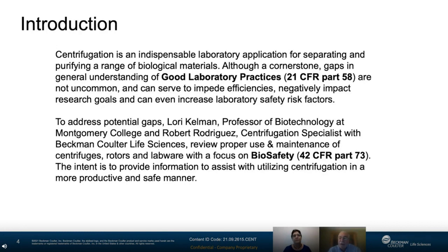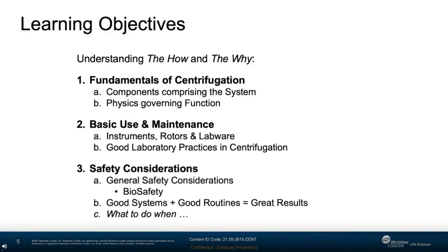The intent is to provide information to assist with utilizing centrifugation in a more productive and safe manner. These are our learning objectives for the talk, and we're going to review the fundamentals of centrifugation, talk about the basic use and maintenance of centrifuges, and discuss centrifuge safety in general. I'll be talking about the how, or probably what I'd like to call Centrifuge 101, and Bob will be telling you more about the why.